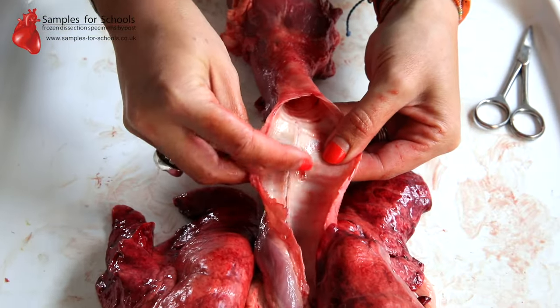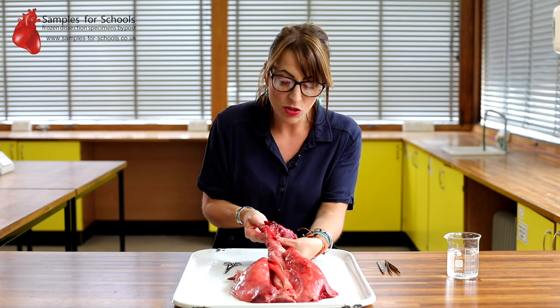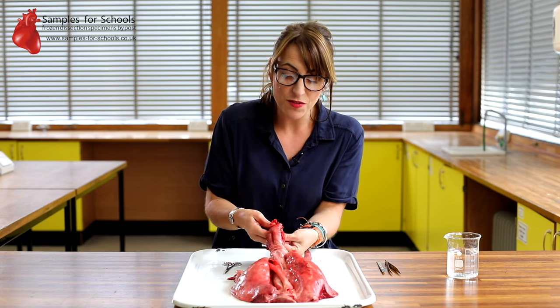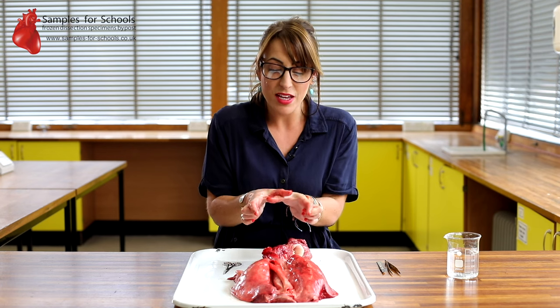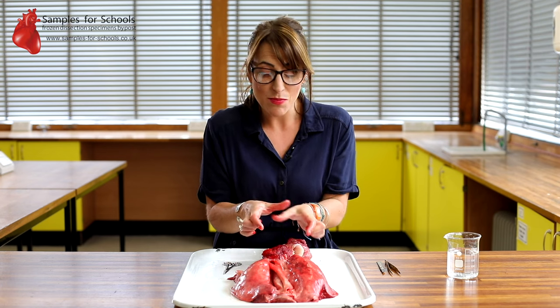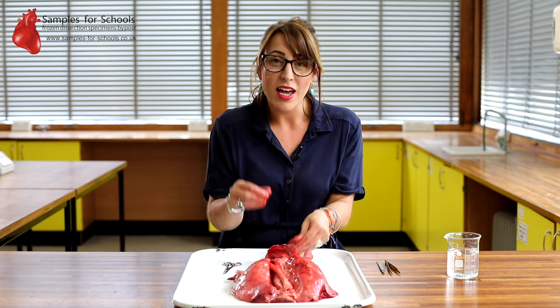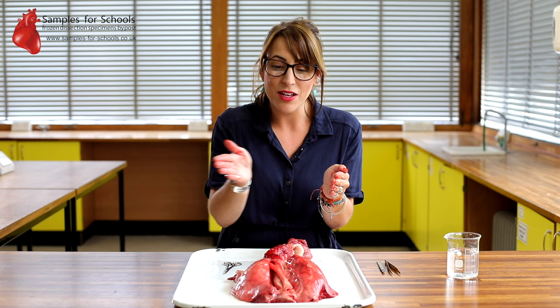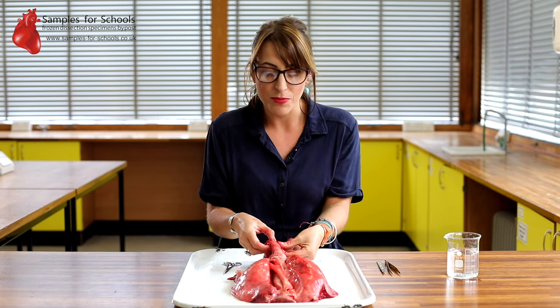There. Now, if we cut them open, you can see each line of cartilage. But they're not complete rings. In fact, you can feel that there's a soft spot on the underside, and that's because they are C-shaped rings. That means that if you're swallowing a large amount of food, the esophagus has some flexibility to press up against the trachea without constricting the airway.